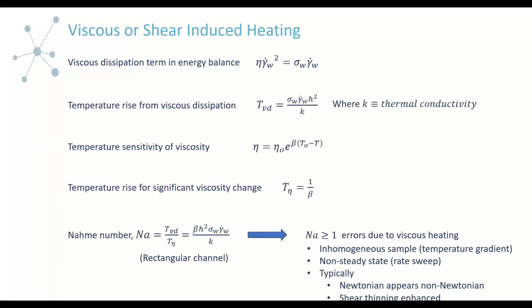Okay, so the final thing we want to talk about, and unfortunately I don't have data to show you, so this is probably less satisfying to see all the equations, but let's go through this and it'll help you understand whether you should or should not expect some viscous or shear induced heating in your system. And then we'll discuss what that may look like, even though I don't have any example for you.